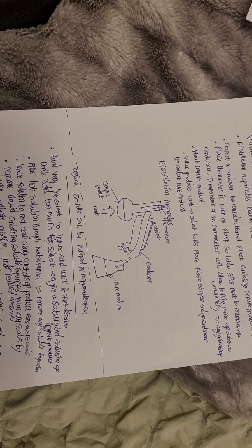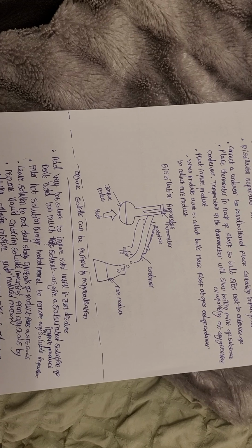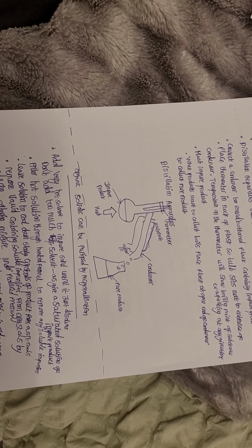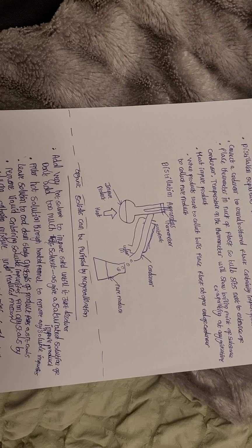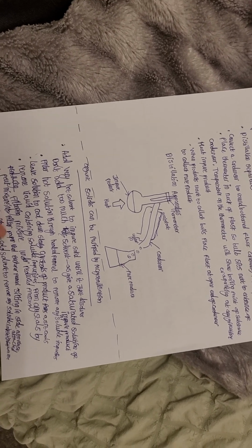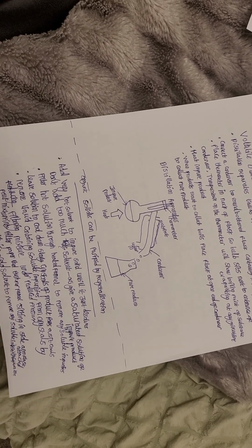Pour the mixture into a filter paper lined Buchner funnel sitting inside a flask with an arm, attached to the vacuum line. Wash the crystals with ice cold solvent. The cold solvent is used to remove any soluble impurities.